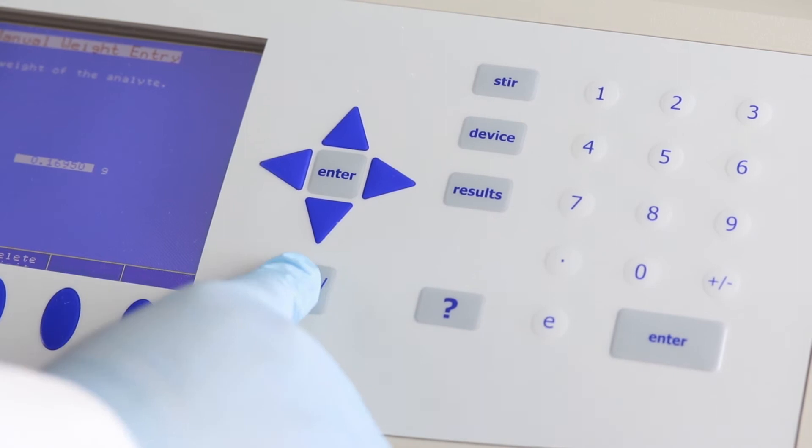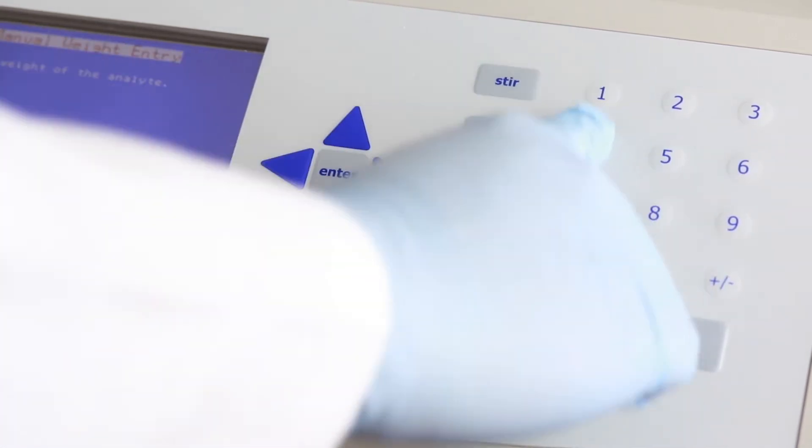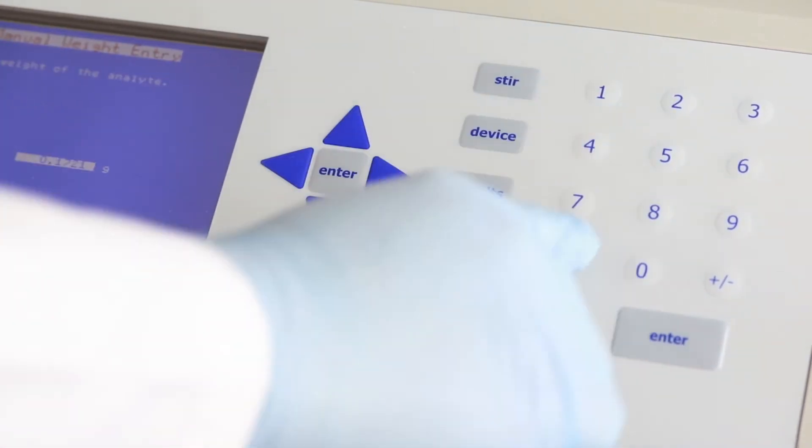Now, I press start and enter the weight of the surfactant sample into the titrator. I press enter, and now our analysis has begun.